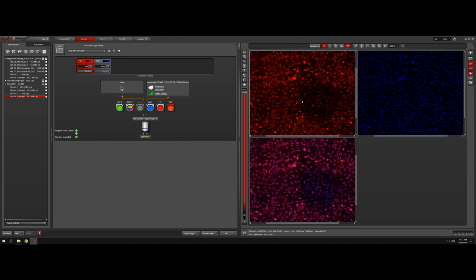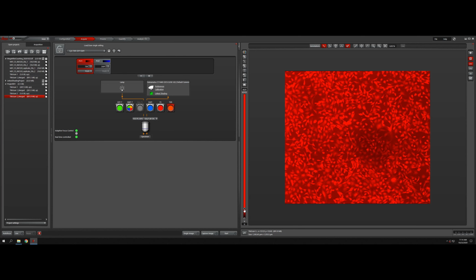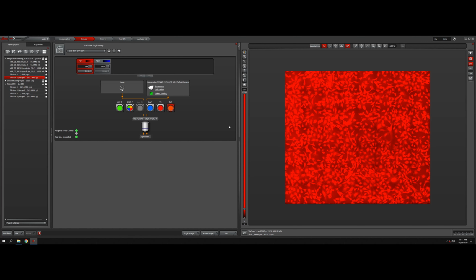I'm going to take a look and see if the borders between frames are less visible or noticeable here. The one that we did earlier was this one. Look at this. You can see these little dark regions, this pattern, and those are the borders of individual tiles or frames.